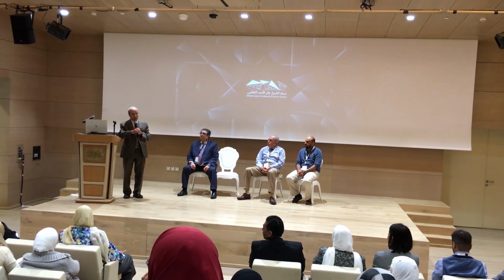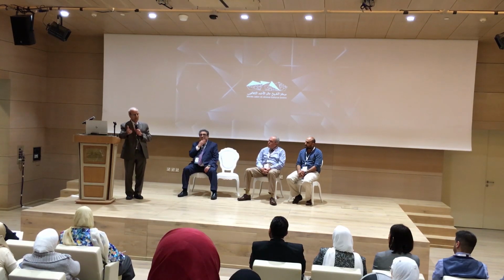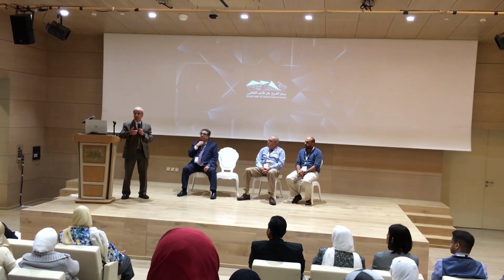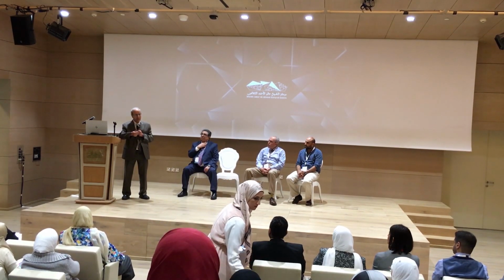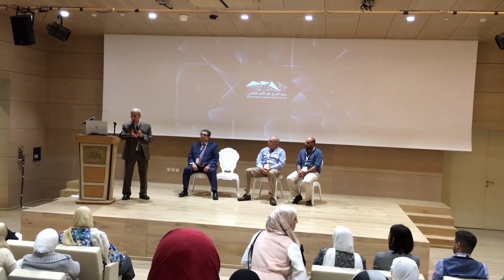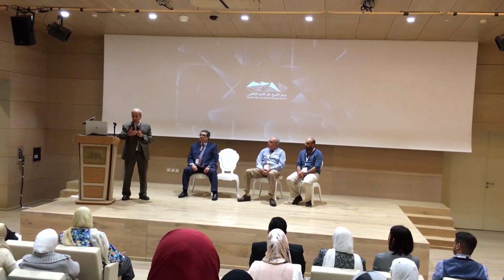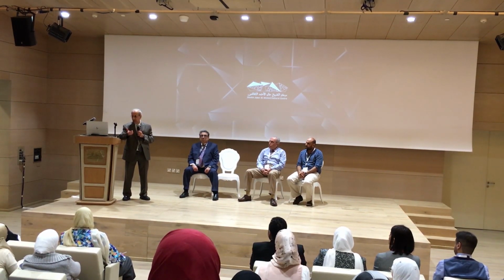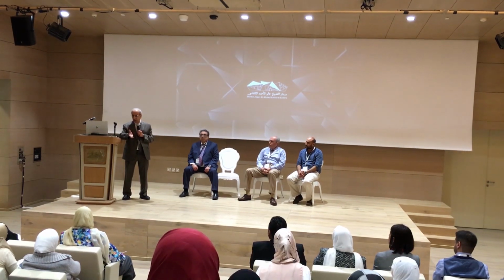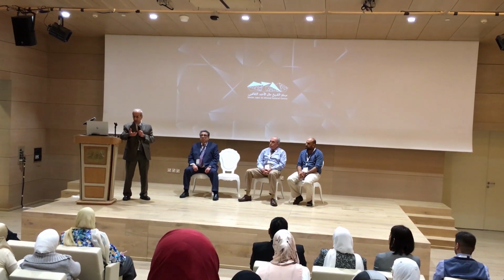And during this time, then I select my team. I look at your menu and I decide how many inspectors I have to have on the team. Let's say you have 4 or 5 sections. We normally expect every team member to inspect at least 1 or 2 checklists. Most international inspectors are familiar with the process, they're experienced, so we can easily check more than 2 sometimes, 2 or 3. But on average, 1 or 2 checklists a day can be inspected. So based on that, we choose the team.